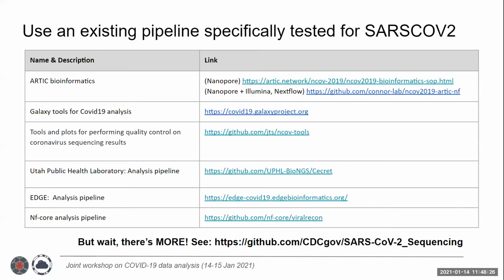The second thing to remember is SARS-CoV-2 isn't particularly special either. It doesn't have a very complex genome. And I think after 1 year, we've sort of exhausted all the different analysis approaches that you could attack it with. For instance, I myself tried to dig deeper into the basis of the variant calling for SARS-CoV-2, and I tried to calculate different metrics of all the mapped read data. And I thought I was very clever. This is actually a similar question to what someone asked Matt just before. But all I was doing was totally redundant because actually all the information I wanted was produced as part within the Arctic bioinformatics workflow and also in another tool called NCOV tools as well.